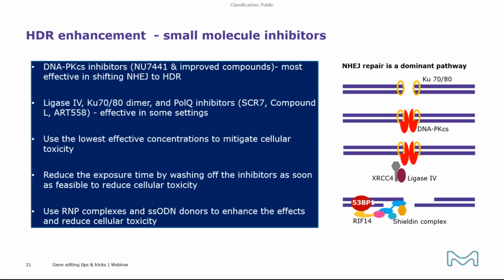However, when using these inhibitors, one must exercise precautions, and we recommend using the lowest effective concentrations, reducing the exposure time by washing off the inhibitors as soon as feasible, and using RNP complexes and oligo donors to shorten the editing window and reduce the inhibitor exposure time.